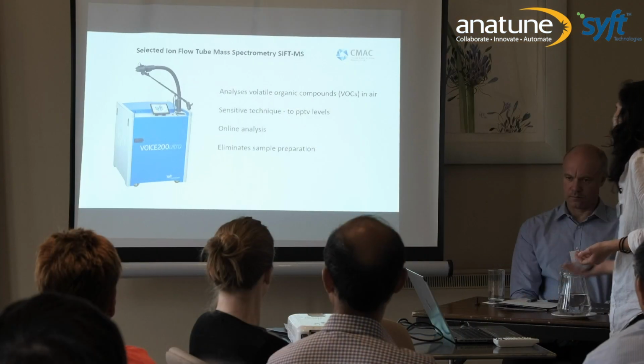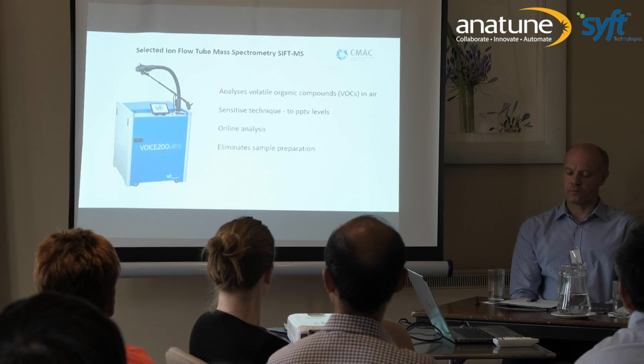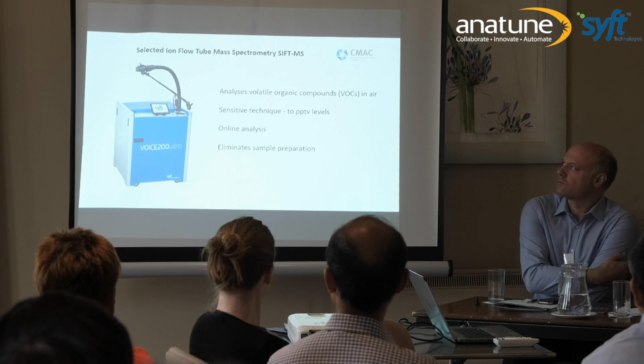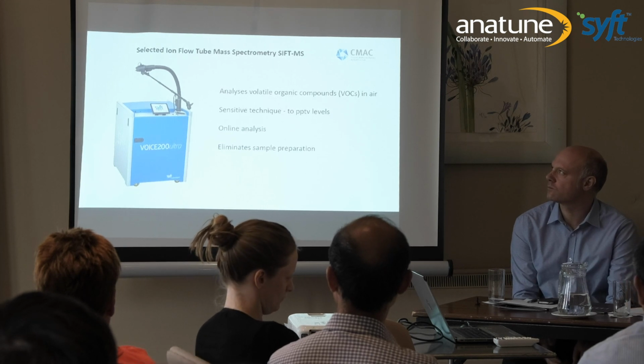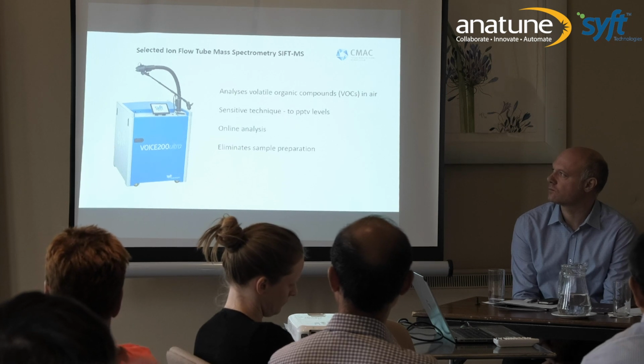In the second part of my presentation, we combined SIFT-MS with the supercritical CO2 extraction process. As everyone knows, SIFT-MS measures volatile organic compounds in the gas. It has high sensitivity, can detect parts per trillion, and can be used online and eliminate sample preparation.